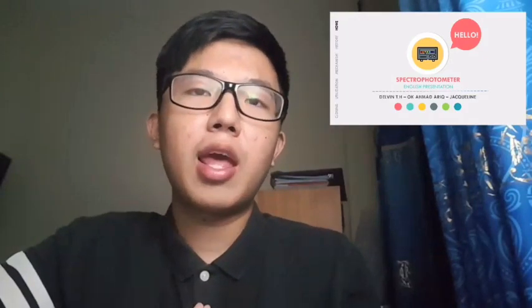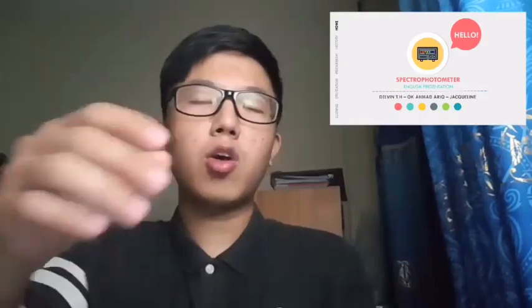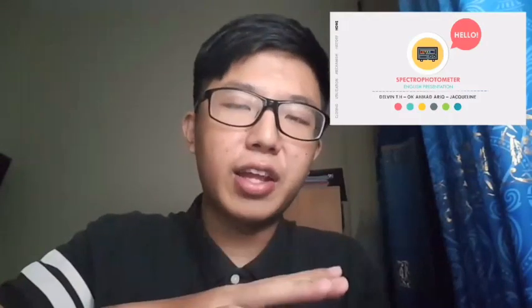Today in this video, we would like to present to you a really interesting topic based on the knowledge that we gain from our department. The topic is about spectrophotometer. Spectrophotometer is an instrument that contains a monochromator, which is a device that produces a light beam with a specific wavelength in a narrow band, and it has a function to measure a beam's intensity that enters and leaves a cuvette. Spectrophotometer has been used widely by many chemical engineers in industry or in laboratories.